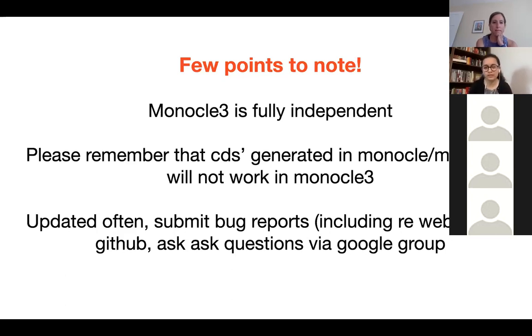This tool is, as you know, on GitHub and it's very often updated. So if you happen to use it quite frequently and notice any bugs in any of the functions downstream, then please submit detailed bug reports on the GitHub issues tab.